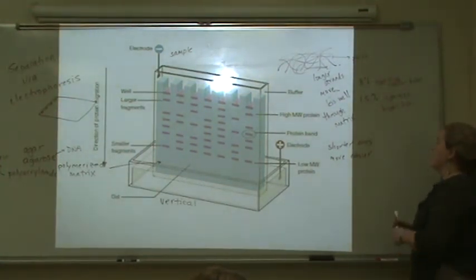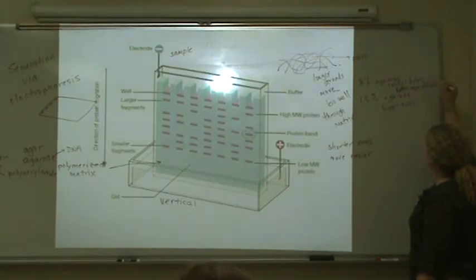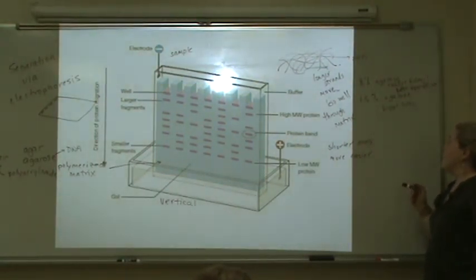And add this on, you get better separation. The more agarose you use, the denser the gel will be, the smaller the holes will be, and the better separation you get.